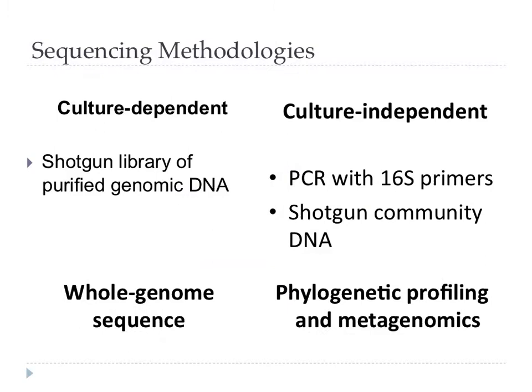When we're looking at sequencing methodologies, though, we're not just looking at genomes, we're looking at two different approaches. We can look at culture-dependent approaches where we actually still have to grow stuff, and then we pick it off the plate and do things. And there we can genome sequence the purified DNA and get a whole genome sequence out at one end. At the other end, we can look at culture-independent approaches where we don't actually have to put anything on agar plates. And there are really two kinds of ways of doing that.